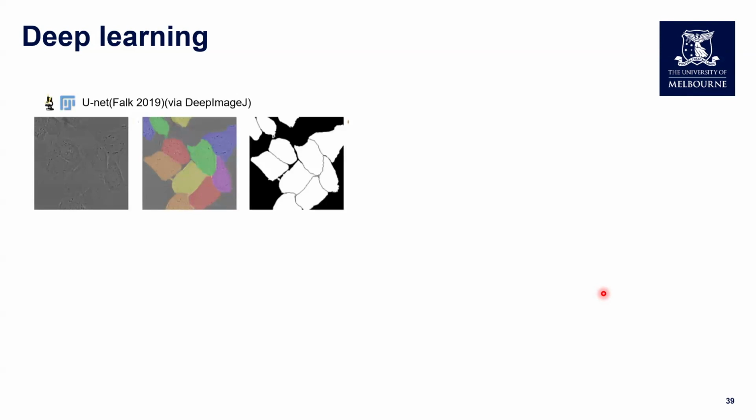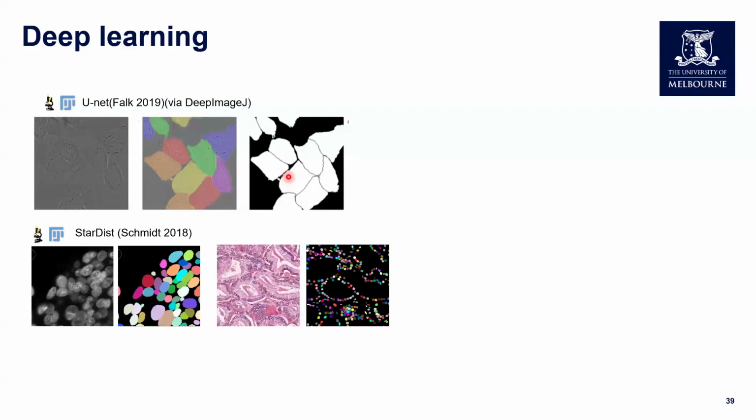And in bioimage analysis, as I mentioned, it can be used to detect very complex patterns. So, for example, a deep learning model called UNet can segment tricky images like bright field or EM images. This would be really hard to segment with conventional methods, or sometimes even using machine learning with manually labeled segmentation. Whereas deep learning can perform really well for this type of image.